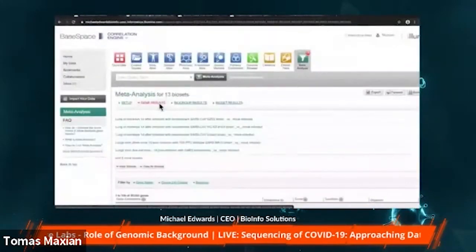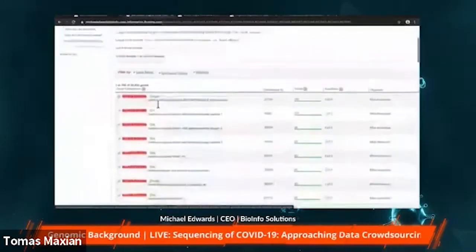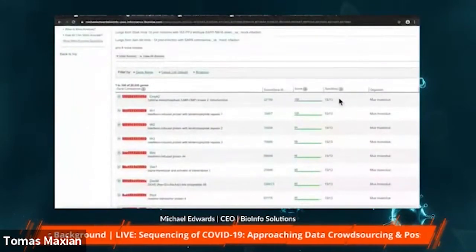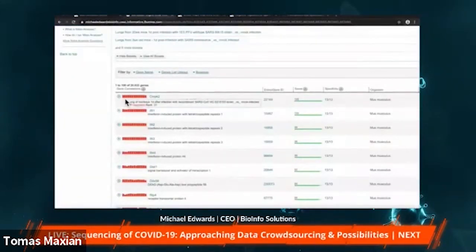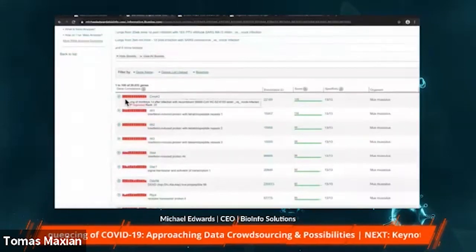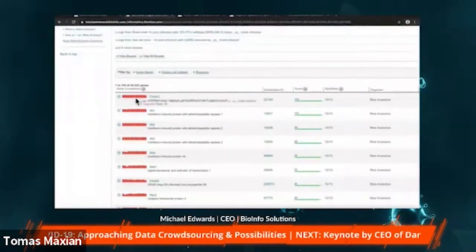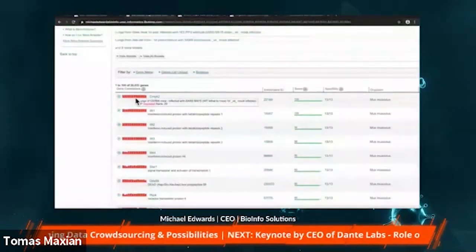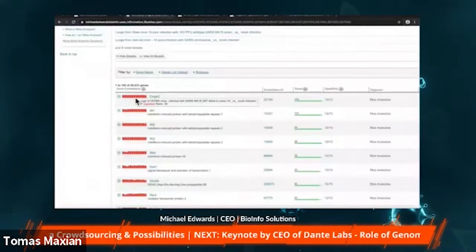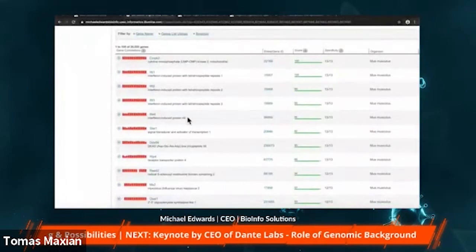Given below on this tab are the genes whose expression levels were altered due to SARS-CoV infection, ranked by the number of biosets that gene was observed to change in. Each column on the side of these genes represents the biosets we picked, while the height of that bar represents the change in expression of this gene to our mock controls. The higher the red bar, the greater the increase, while green bars going in the opposite direction would signify a decrease to control. We can see that most of these top genes increase due to infection, although when taken as a whole, most genes in this analysis on average went down with infection.